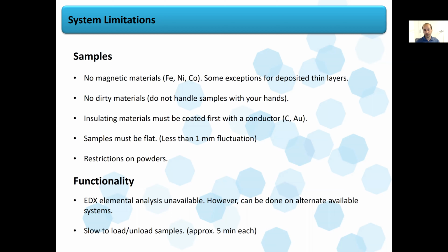Also, we're mostly dealing with flat samples. We're not doing much geological type samples that have a lot more surface topography. And while we have done some powders, in general, we try to stay away from powders just due to the risk they pose to the system. We do not have EDX on this system. However, there are other EDX systems on campus. Again, that's for doing elemental analysis and determining what your sample's made of. But if you do need that, we can direct you or help you with that service.